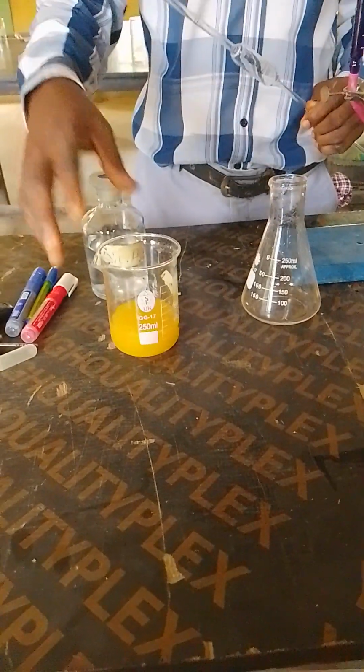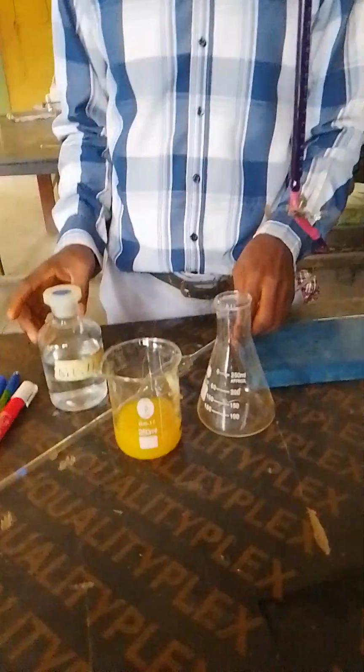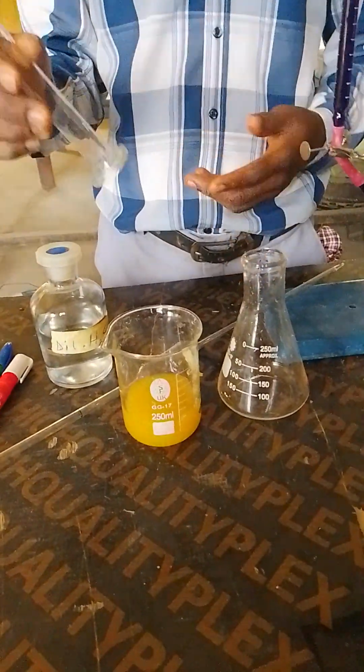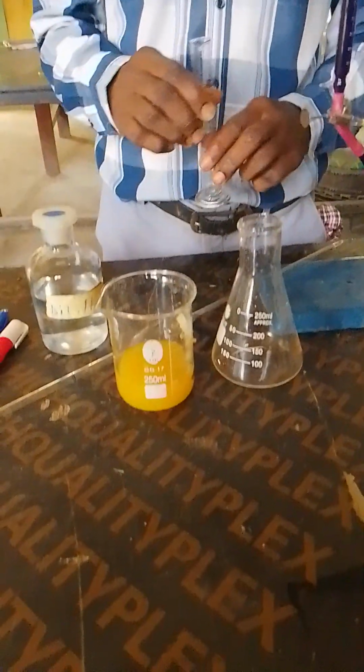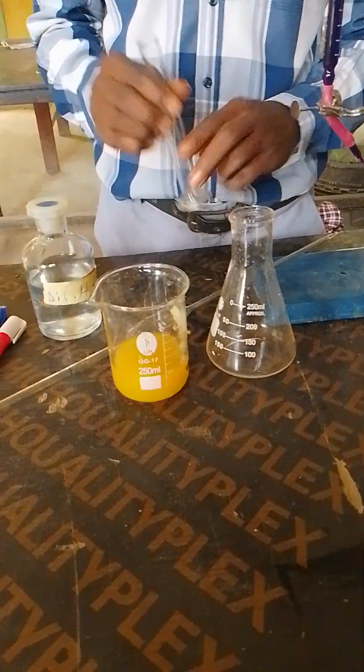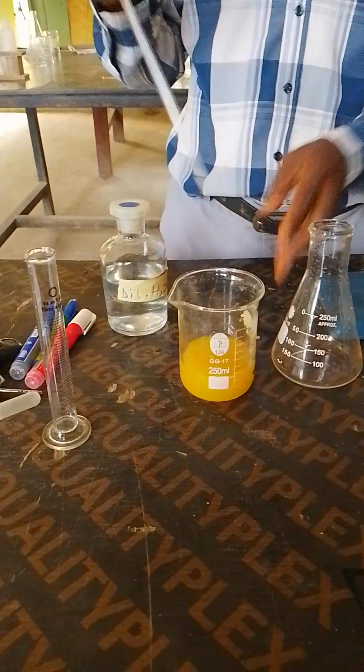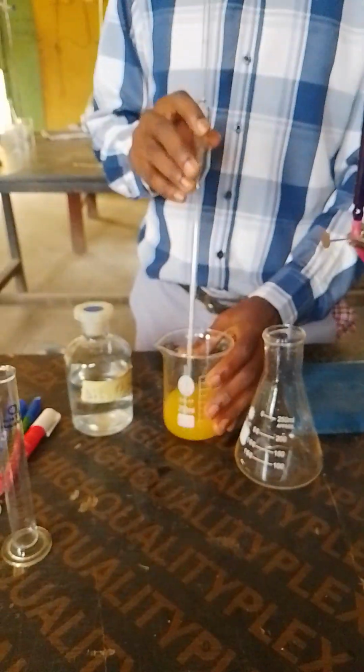Okay. Now, one good thing that you must understand is that this process must continue in acidic medium. So you are going to measure either 5, 10 or 15 cm cube of H2SO4. Don't use hydrochloric acid because that will liberate chlorine gas. So I will prepare my iron sulfate now.